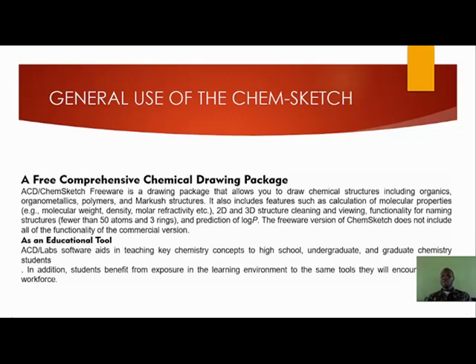Now, this software version does not include the functionality of the commercial version. That's why I began earlier by telling you that we have two versions of this Chem-sketch: the freeware, which is normally for personal and academic purposes, and the commercial version for companies and governments.